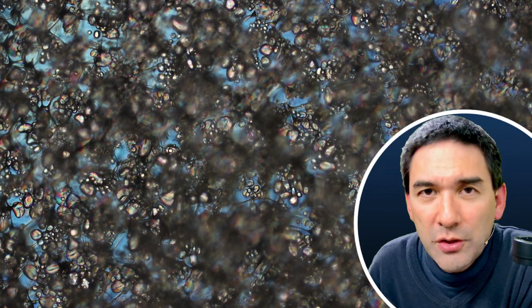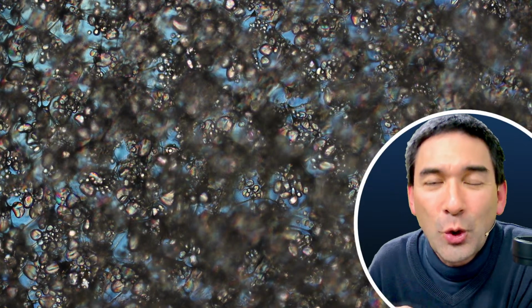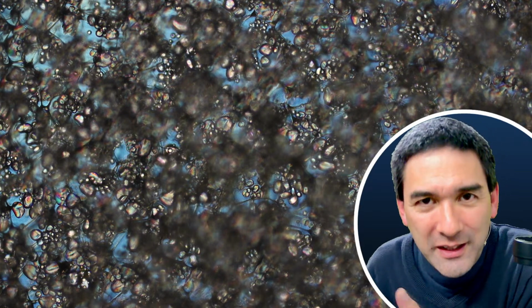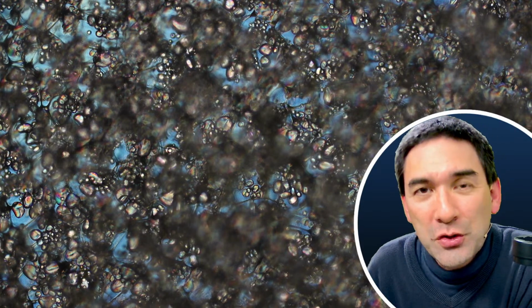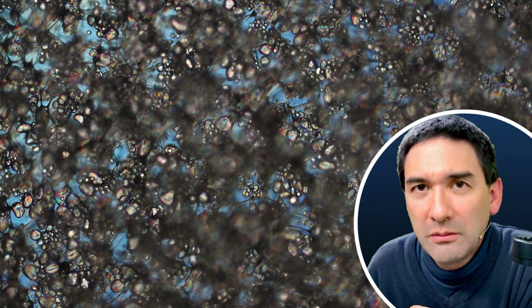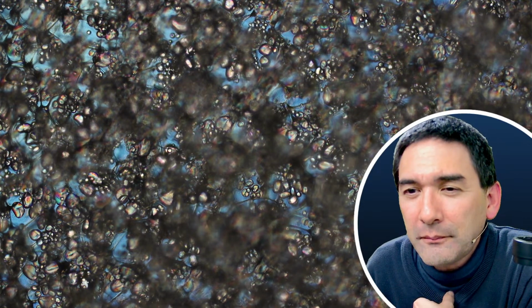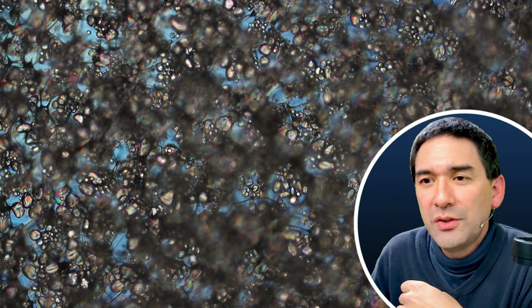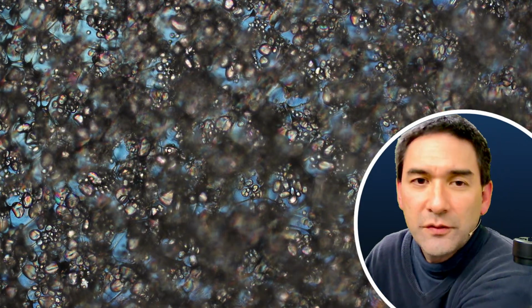I'm just saying, if you use iodine, make sure that it does not get into contact with the optics. Otherwise, you can use it. Iodine is a normal stain that is used in microscopy a lot, but especially at higher concentrations, I read it's quite corrosive, and one should take care that it doesn't stain anything. They are beautiful using polarized light. I was using it by adding it to water. Yes, then you're diluting the iodine down, and then it's less of an issue.